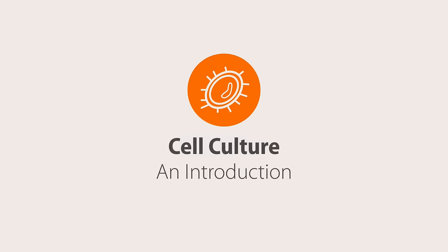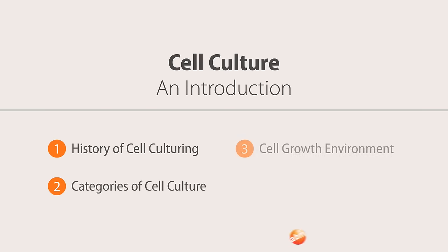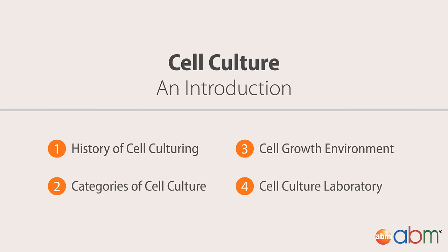In biology, cell culture is the process by which cells are grown in controlled conditions outside of its native environment. This technique has enabled scientists to use cells, the fundamental unit of life, as an imperative model system for understanding physiological processes in the human body.